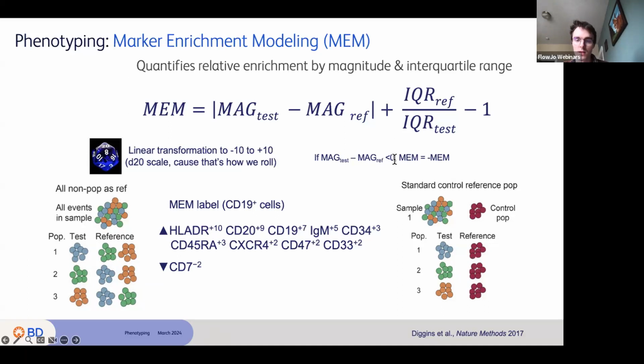So the first question, going back to cluster check, was: is there a certain cluster check value that's considered good or bad? I don't have a value off the top of my head. I usually just look at the colors to try and identify where the splits might be. You can also look at the clusters in your FlowJo plots to see if there's actually a split there, or if it's just noise, some variance. We can look at that more in our live demo.